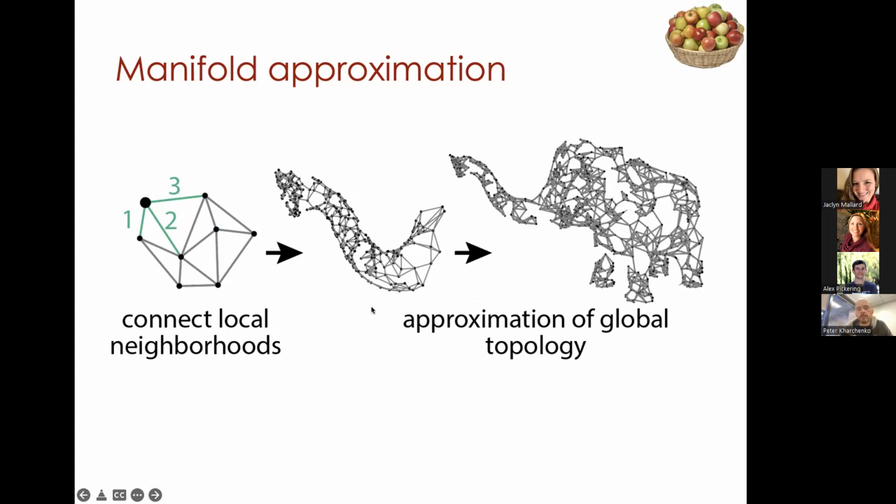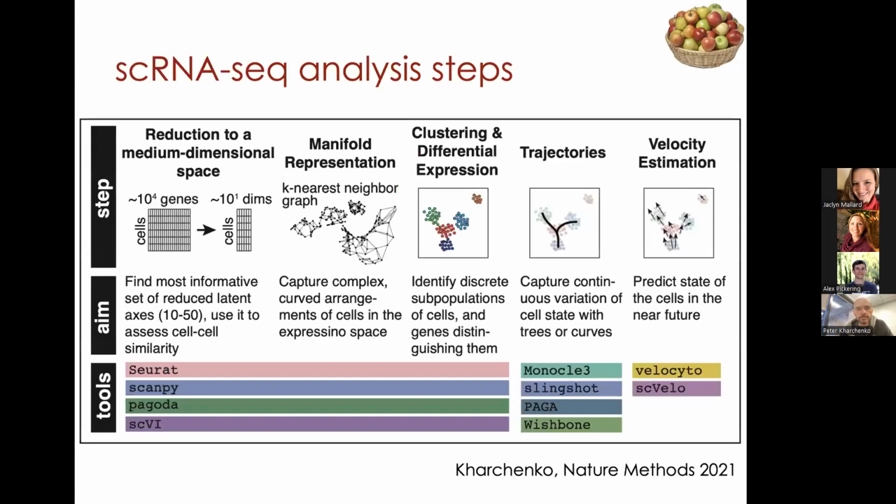So we have an idea about connectivity between different populations and how they flow into each other. Clustering, which is very commonly used, trajectory analysis, and so forth are effectively ways of formalizing what the structure of these populations is, whether continuous structures or discrete structures like clusters.